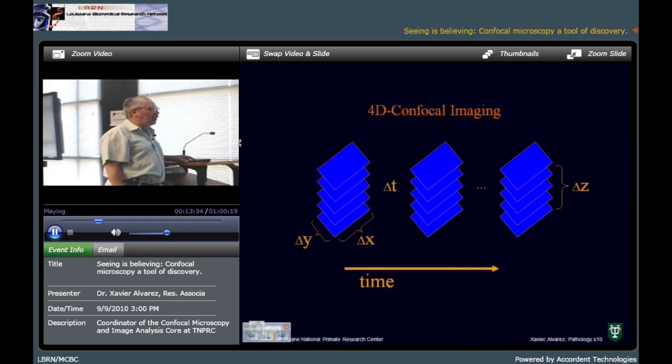And then with that optical slicing, we could do at least four dimensions. X, Y, and against time as 3 dimensions, and that's a movie. All these movies that we do digitally is just X, Y, and against another dimension, time.